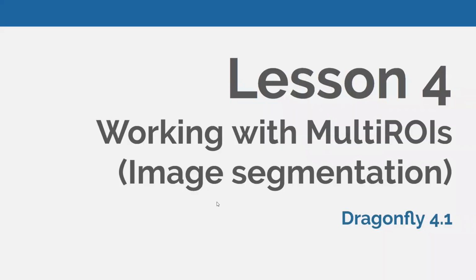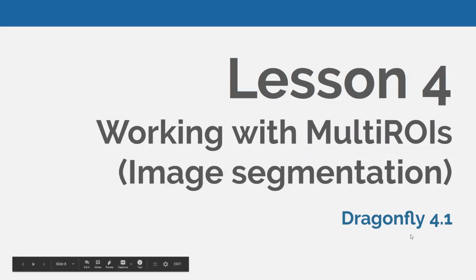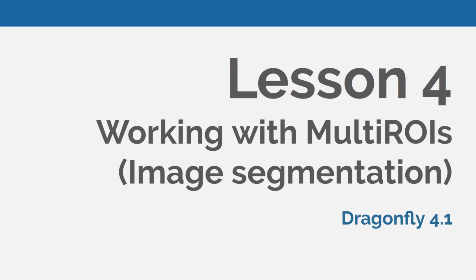So, lesson 4, working with multi-ROIs, image segmentation. We are using Dragonfly 4.1, so if you have Dragonfly 4.1, you can install it, or you can follow the webinar on installing it. And we're just using the out-of-the-box experience, so you can do these exact exercises just like I'm doing.